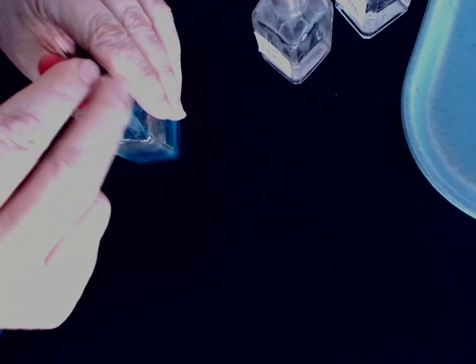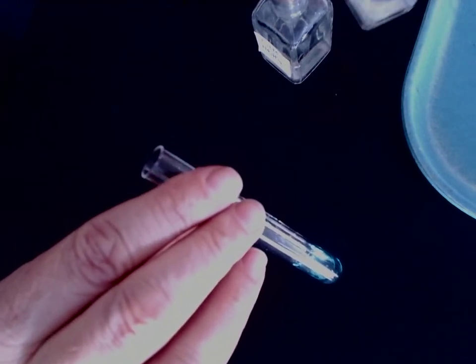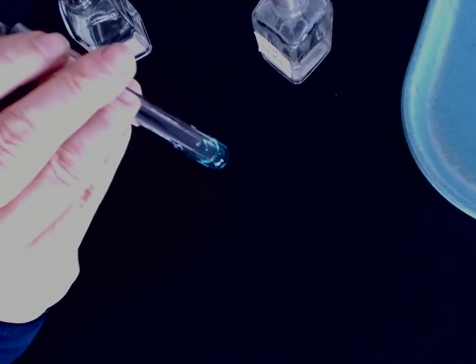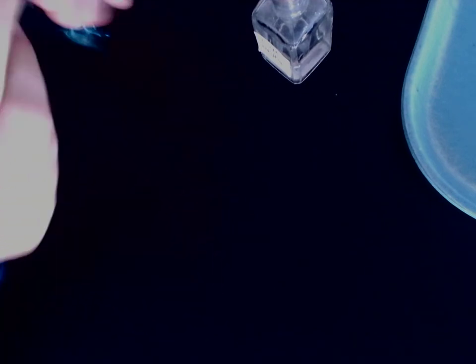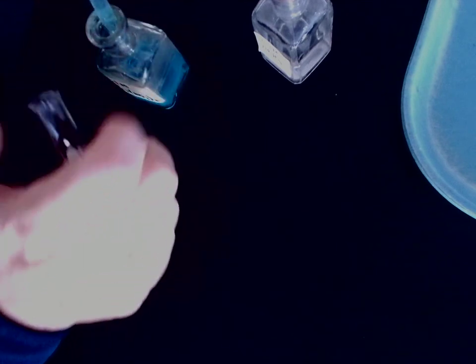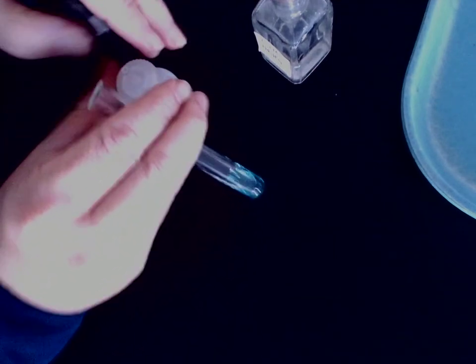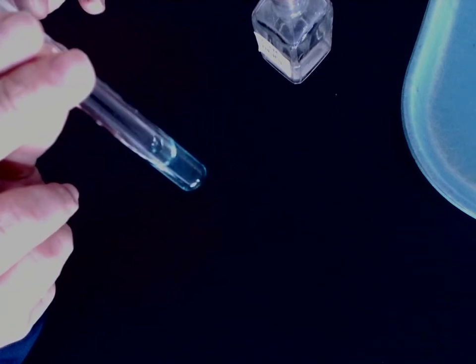Next up, copper nitrate with zinc nitrate — there's the copper nitrate, here comes the zinc nitrate. And then next up is copper nitrate with magnesium nitrate — here comes the magnesium nitrate, there you go.